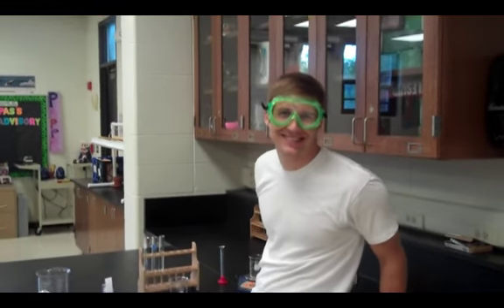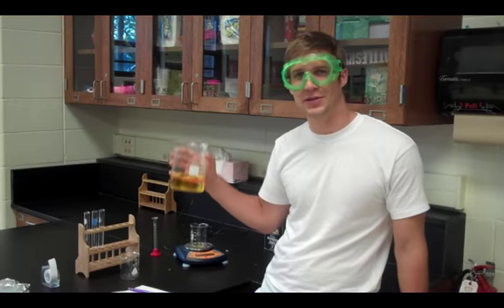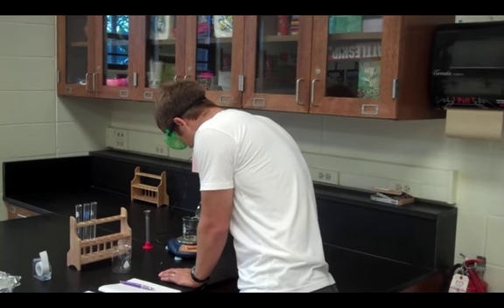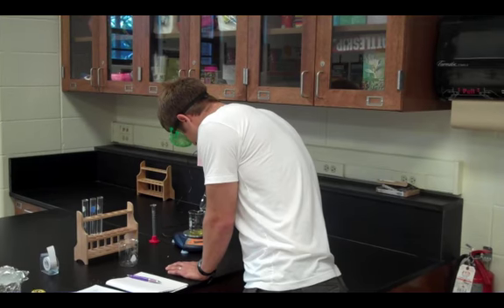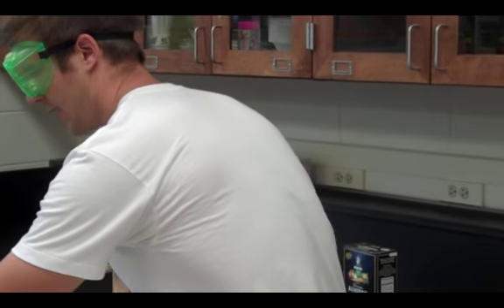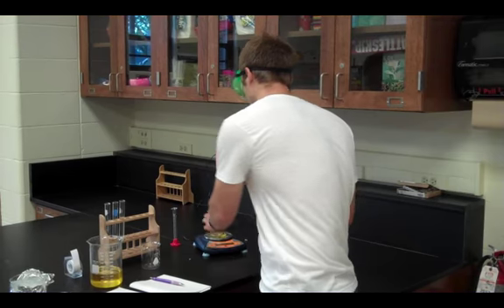Hey guys! To make solution A, I'm going to take 5 grams of the antifreeze and I'm going to measure that out in my beaker here. And then I'm going to take 50 milliliters of water and add that to my antifreeze.